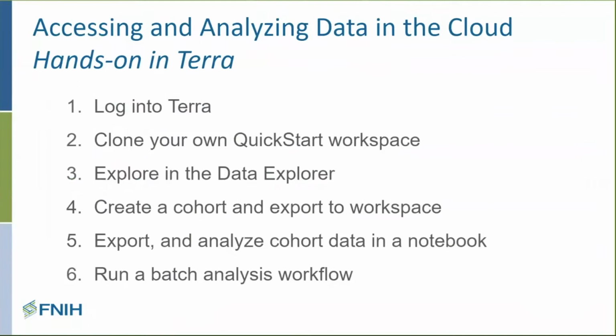That's my general overview, and this is an outline of the next portion, which is hands-on accessing and analyzing data in the cloud. And we're going to do 6 things. I'm going to have you log into Terra if you aren't already. And I'll give a quick overview of where things are. And then you're going to clone your own quick start workspace. And we'll see some of the pieces that are there.